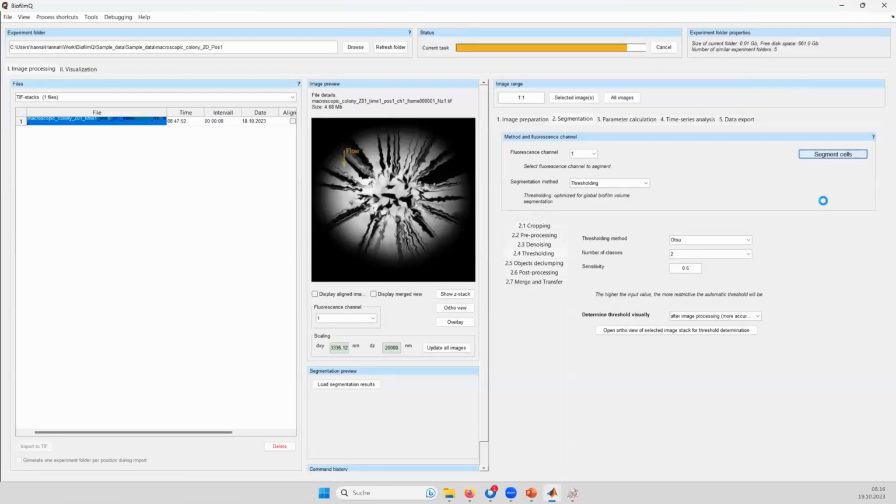Hannah, can I ask you just quickly? Would you always aim to have the same segmentation settings if you have multiple channels? If one channel, for example, is not as bright as the other one, wouldn't you use a different sensitivity? Yeah, absolutely.